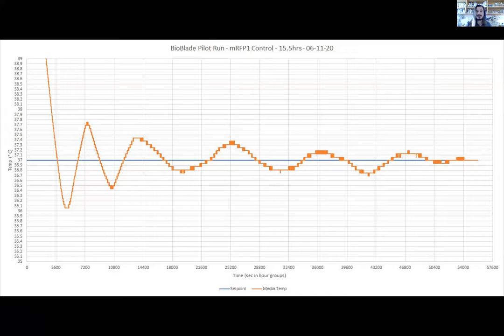This thing is super stable. I mean, I blew on it, I turned on the windows, I turned on the AC. Once it stops ringing, it compensates for it beautifully. But even without the ringing, you're still within 2 degrees Celsius, which is enough for most projects.